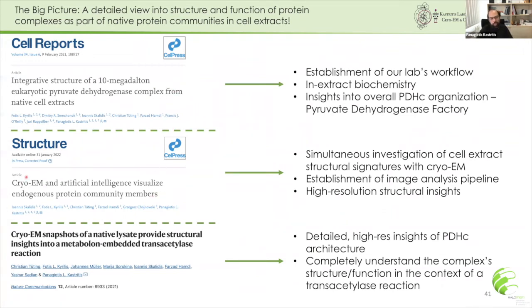In this paper, we used the protocol that I showed you last, characterizing these different structural signatures with Cryo-EM and artificial intelligence. I also showed you parts from this paper where we have higher resolution of the core of the pyruvate dehydrogenase complex and how we better understood the transacetylase reaction happening there.